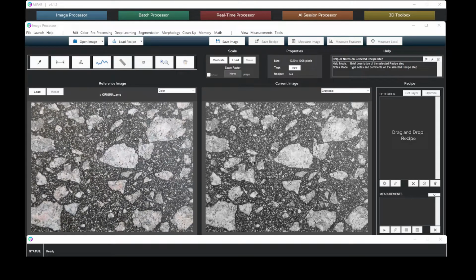When performing analysis of particles, scanning electron microscope data can pose unique challenges due to variation and noise. In the past, this analysis would be done manually. An operator would measure the particle diameter. This manual process was extremely time-consuming, especially for larger sample sets.